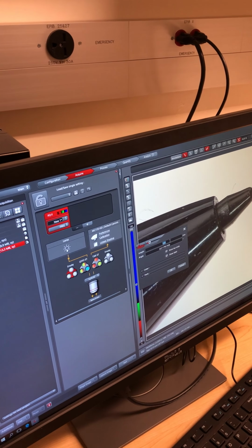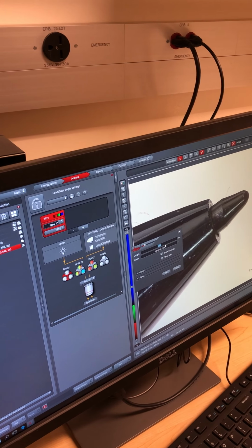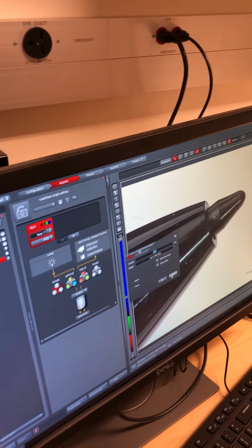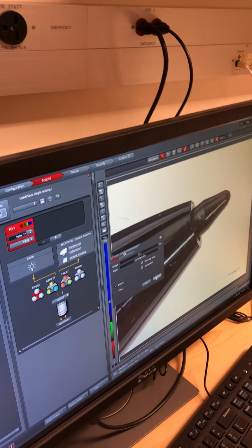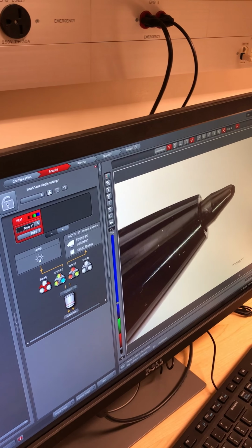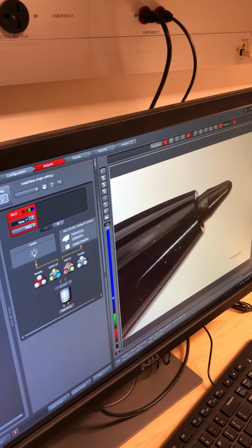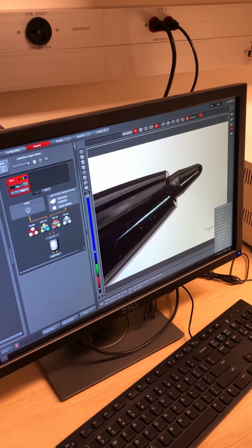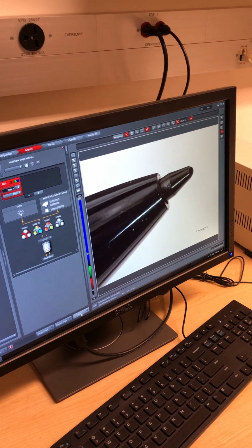Oh, I see what you mean. I can see you can change the angle. I think you can make it 0, whatever. Yeah, right. It'd be nice if you just clicked it and it just showed up, and then I could alter it if I wanted. Let's play with that real quick. It's not something to spend a million years on. I think it will show up in all of the acquisitions once it's there. Let's just acquire another one.